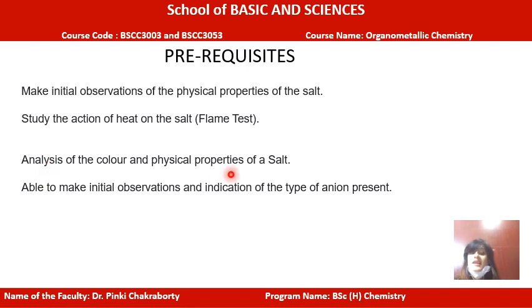Third point is again related to that. Why we are specifically saying color and physical properties of the salt is because many cations or anions impart similar type of color to the salt. So the student should be able to distinguish between those type of salts as well.